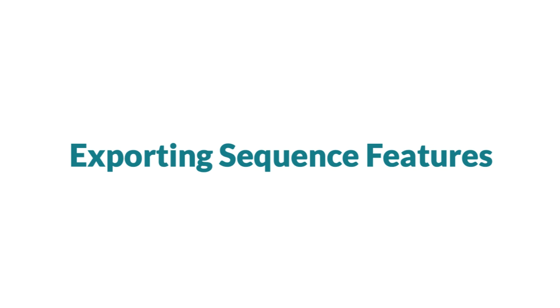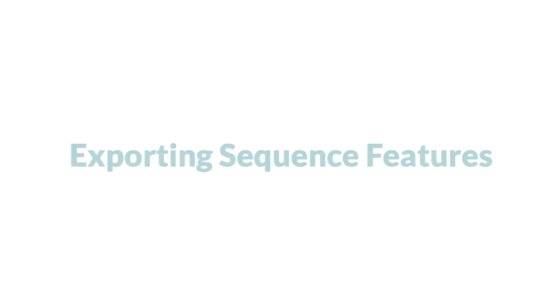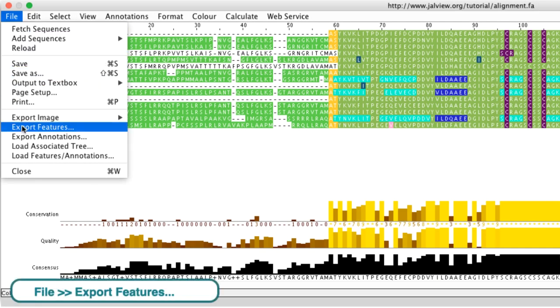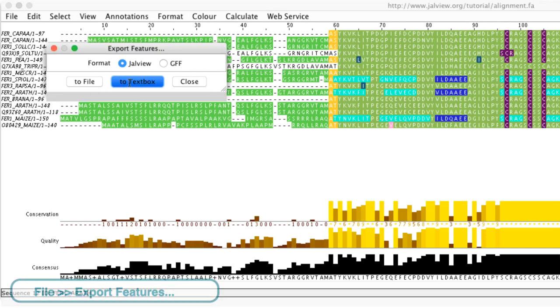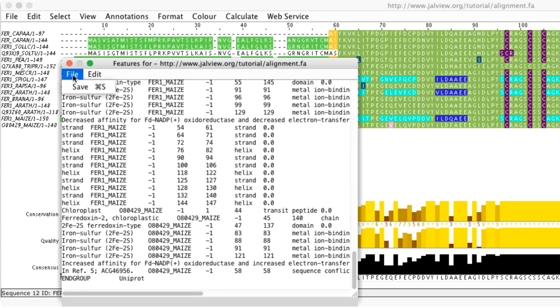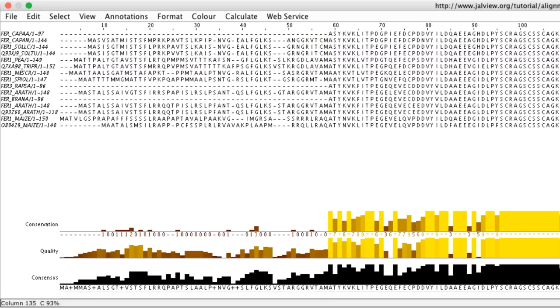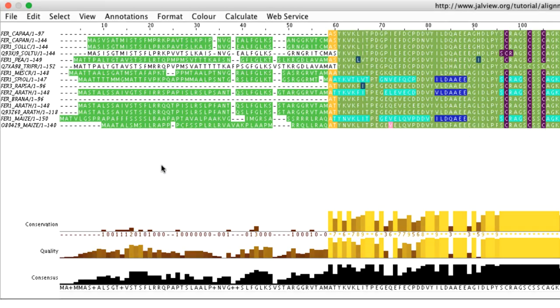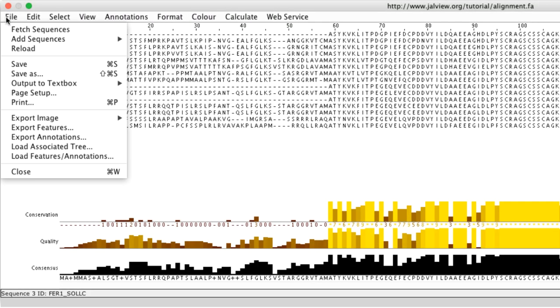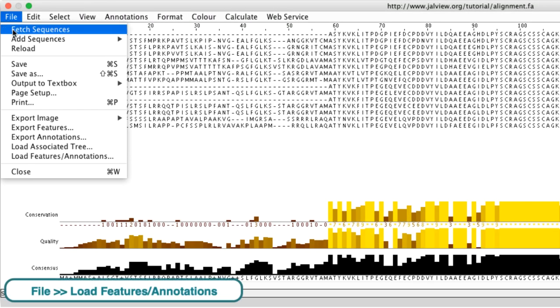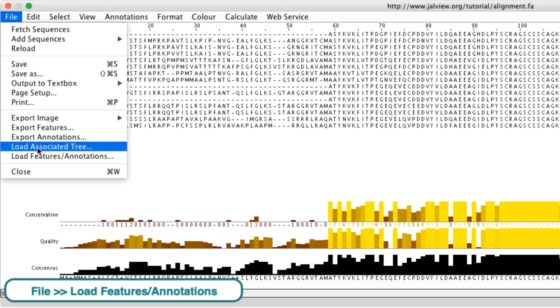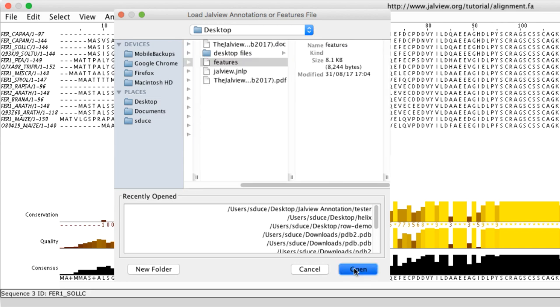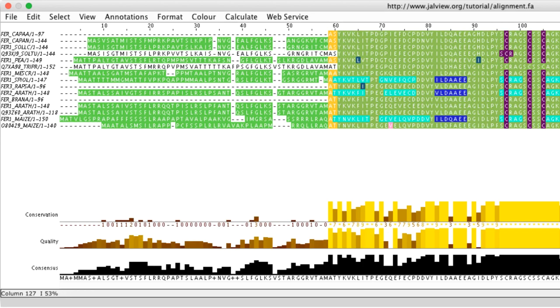Sequence features can be exported by going to the file drop down menu and selecting export features. The file can then be saved. Dragging and dropping the file onto the alignment or using the load feature slash annotation option in the file drop down menu will add features to the alignment.